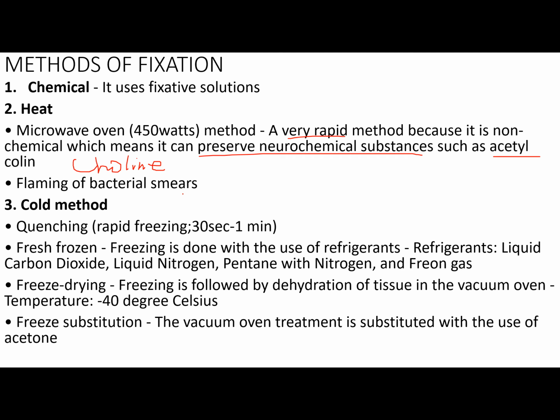Then we have your fresh frozen. Now, fresh frozen freezing is done with the use of refrigerants. Refrigerants could come in liquid carbon dioxide. Yung pinaka-common na ginagamit nating refrigerant, class, is yung liquid nitrogen. So aside from liquid carbon dioxide, you could also use liquid nitrogen, pentane with nitrogen, and freon gas.